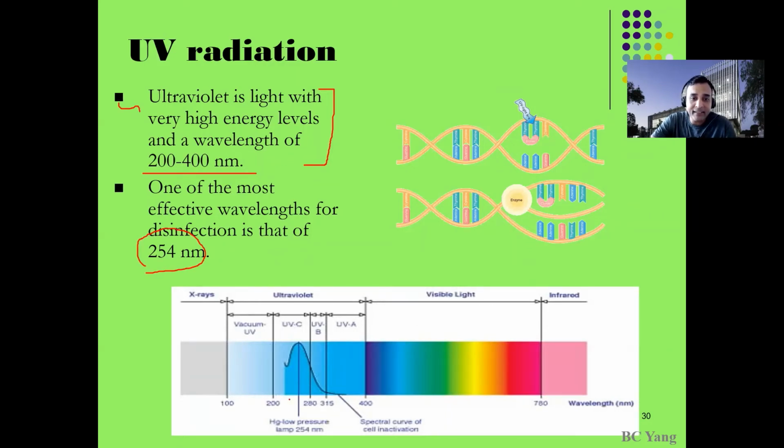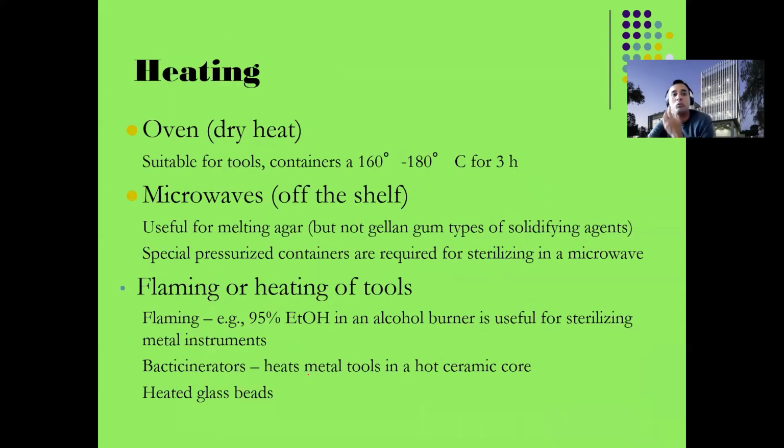This is the UV range. So basically, you remember the blue and red light, right? For the photosynthesis, and the UV light has the killing efficiency. And how does it kill the bacteria and microorganisms? By mutations. It creates a massive amount of mutation on the genetic material, whether it is DNA or RNA. And when the genetic material is mutated with significant fractures and damage, it will definitely distort the whole central dogma. So they will not be able to write proteins, and eventually the microorganism, bacteria and virus will die. Okay, so this is how UV works.